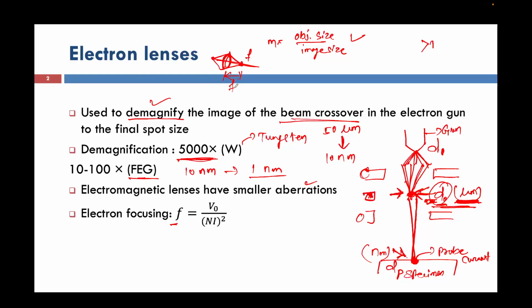We have also carried out some physical experiments earlier, at certain points of time in our life, so we know how the glass lens acts. But when I say the focal length of an electromagnetic lens, what does that mean? The focal length in an electromagnetic lens means the distance from where the electron starts spiraling to the distance at which it crosses the optic axis. Let's say this is the lens and the electron is coming, and from here it starts spiraling and coming down.